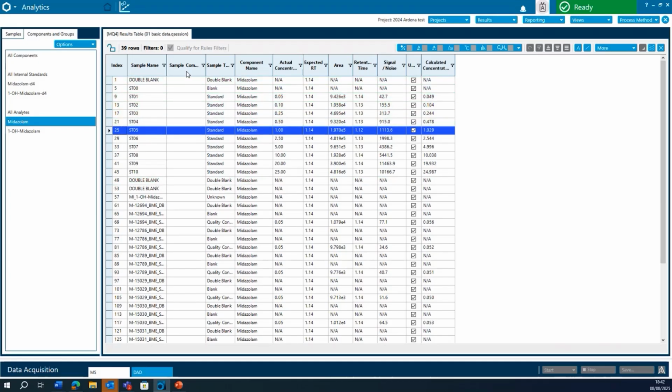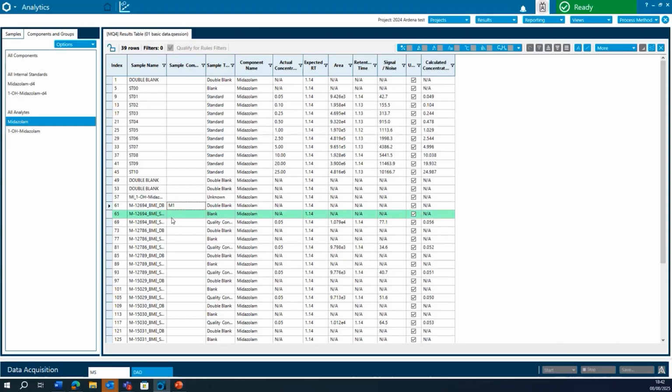And in here you have your sample comments we were talking about. So in here I want to join these three matrix together. So it's M1, sorry. And then this is M2. Copy, paste, paste. M3, let's just do 3 for the moment.